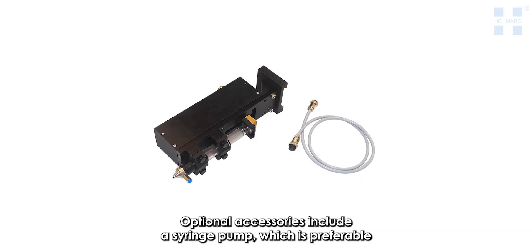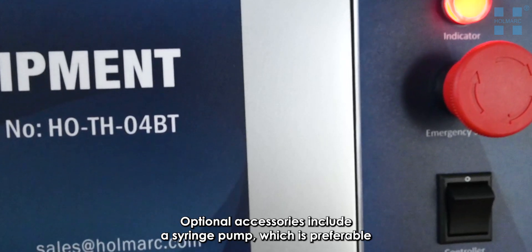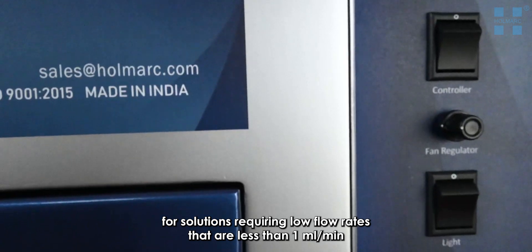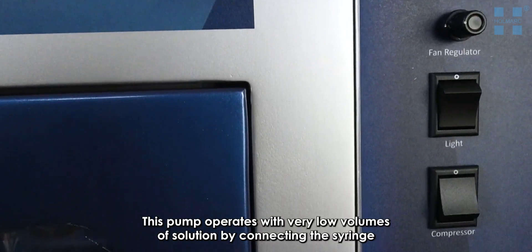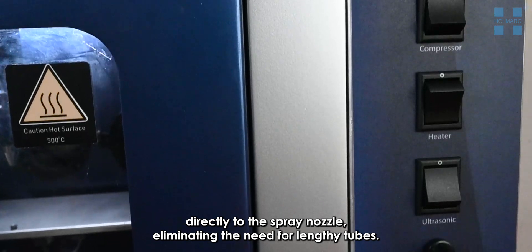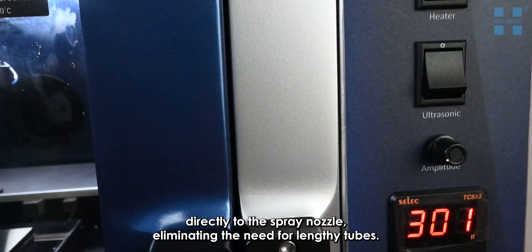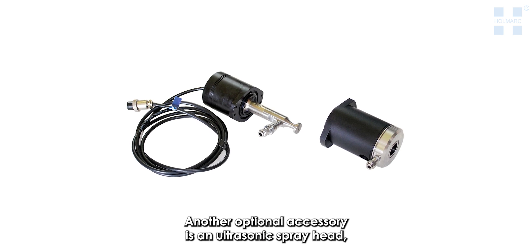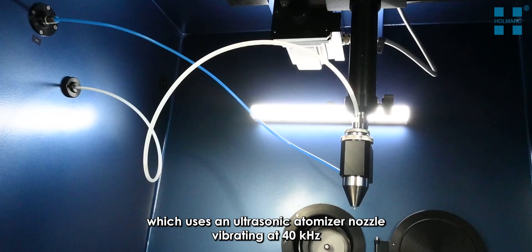Optional accessories include a syringe pump, which is preferable for solutions requiring low flow rates of less than one milliliter per minute. This pump operates with very low volumes of solution by connecting the syringe directly to the spray nozzle, eliminating the need for lengthy tubes.